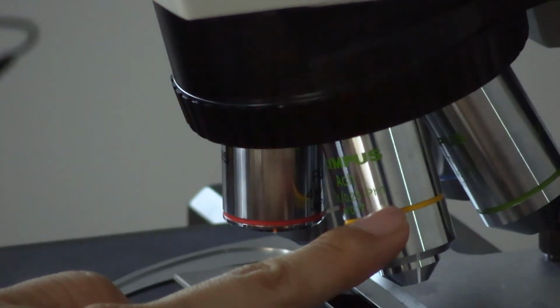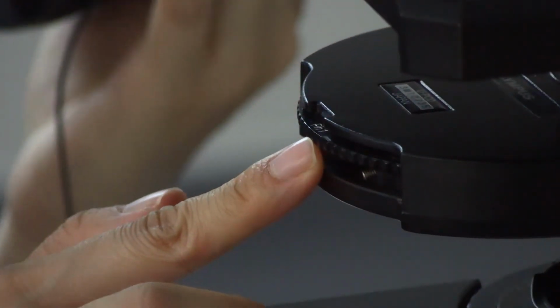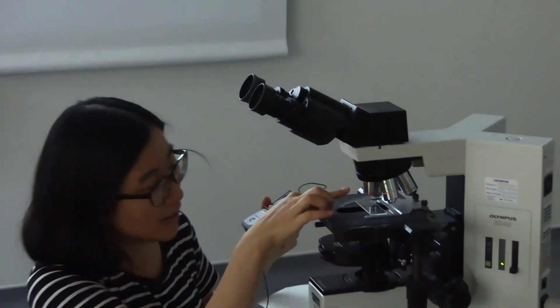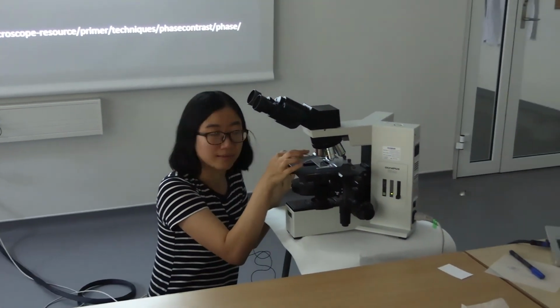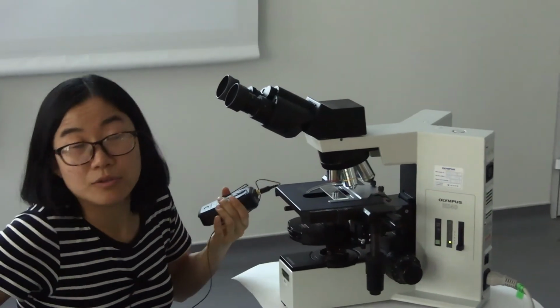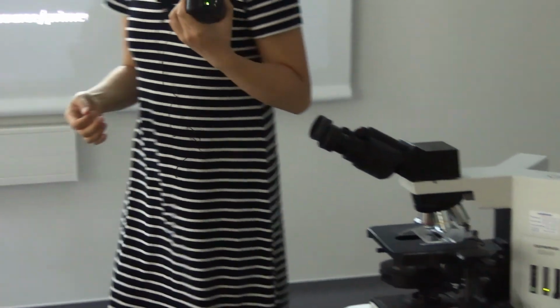It means phase 1. Then you need to set the plate here as phase 1. So the ring here will face the ring inside the objective. Then you will get the best resolution of your image.